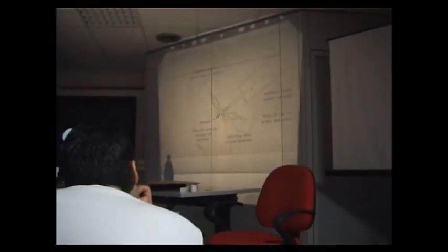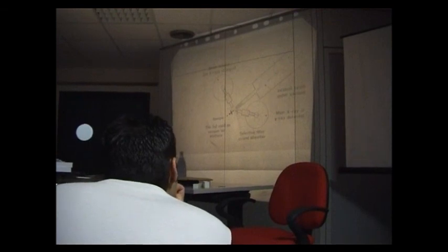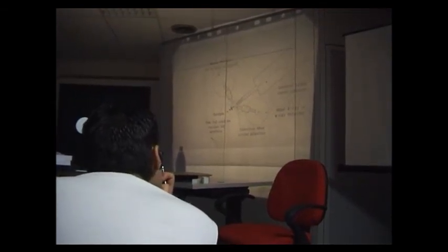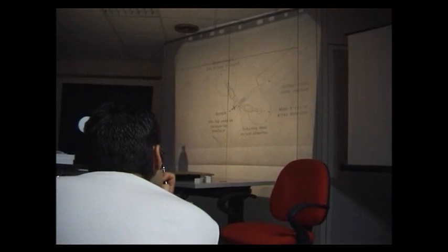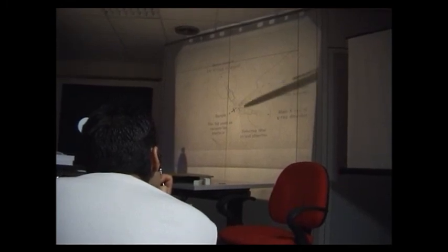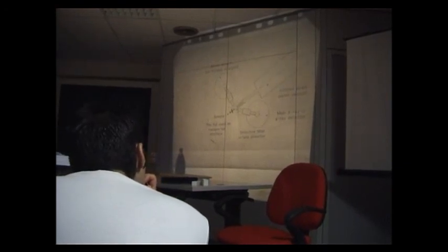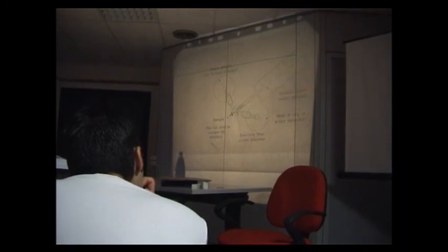Then to summarize, suppose you have to detect X-rays coming from material. We send protons through a thin foil of aluminum. We irradiate some sample, and we have the possibility to detect X-rays in two different detectors.